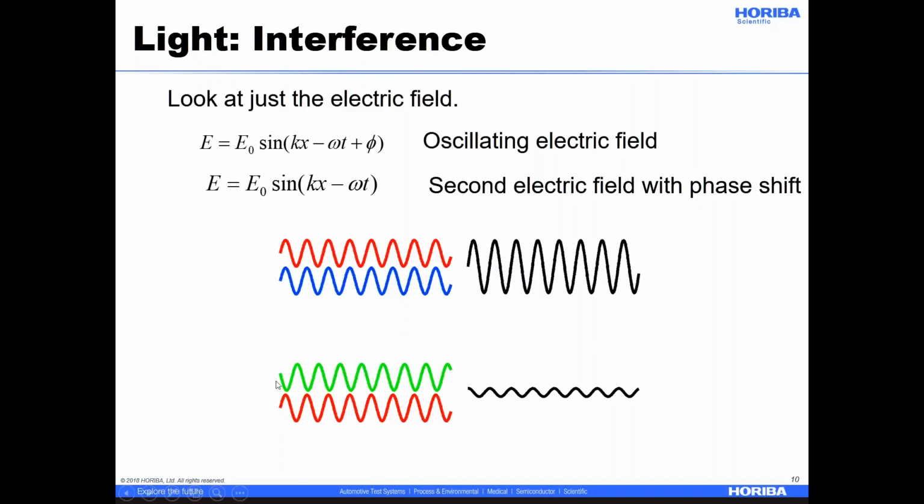You notice here with the red and the green, these waves are out of phase. And so now when I add these up, this is negative, this is positive, it adds up to just about zero. This is positive, this is negative, still adds up to zero. So the resulting sum is a wave with a very low amplitude, or quite a weak signal. And so I can measure the amplitude, that's really the intensity of the light, with the detector.